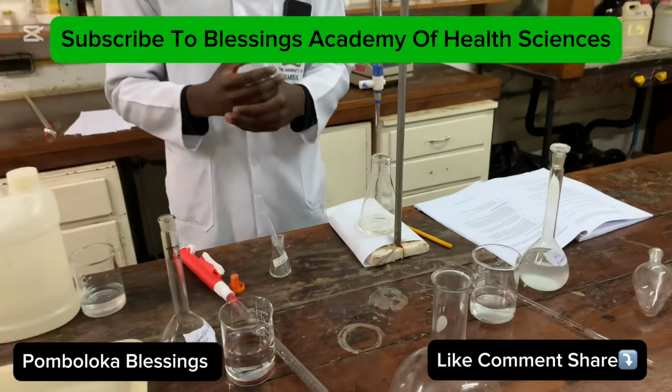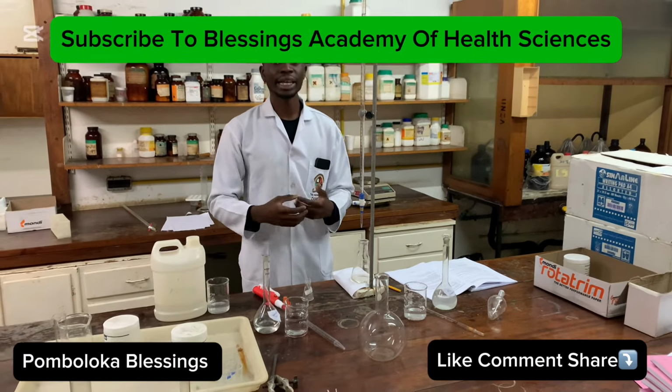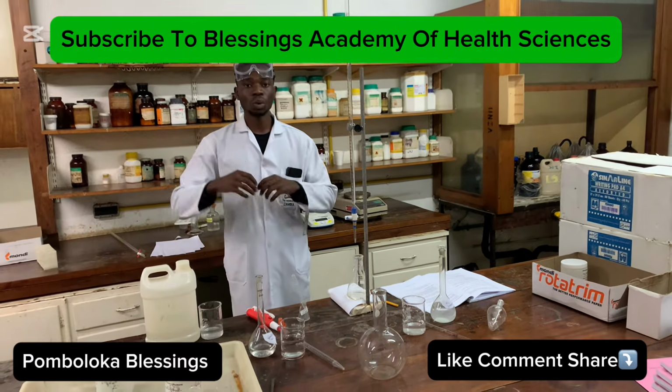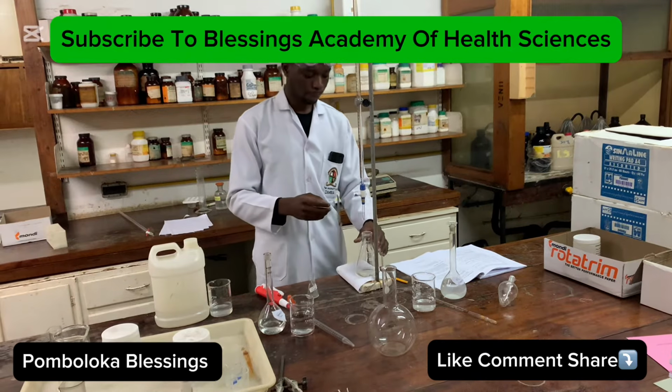Because in the first part of the reaction, when we mixed with ammonia, the ammonia was the limiting reagent, and then the HCl was in excess. And even when it gave us the product ammonium chloride, what we still have in the conical flask here is the HCl.